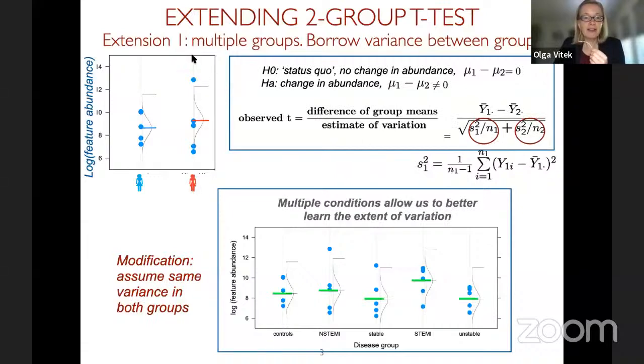If we have a very broad spread of protein abundances, either because the protein is just highly variable naturally from one individual to another, or because our measurement technology adds a lot of noise, then the signal can be very small compared to the noise, and we do not have enough sensitivity. Even if there is an actual regulation, the noise in our data can be so high that we will not be able to detect the signal. So this is one thing that can happen.